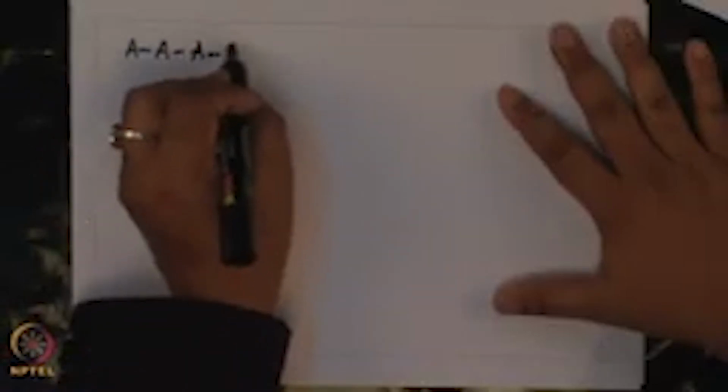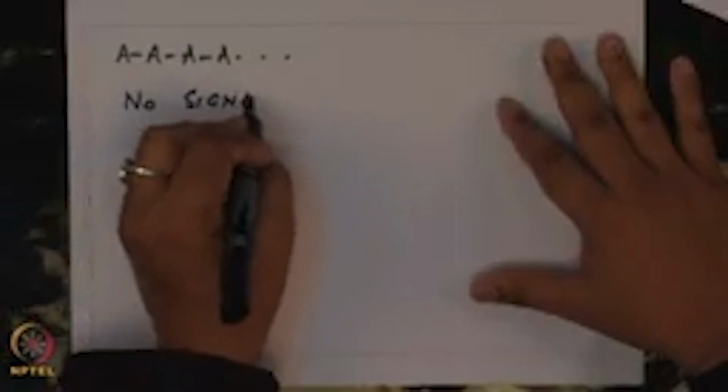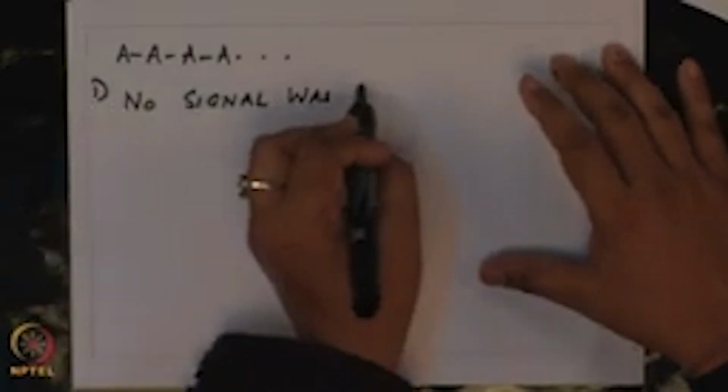After that check, let us say you have made a protein which has this unit A repeating. Typically, if you choose a longer length, there is a greater likelihood that the protein will fold, versus making just 2 A's. But let us say you did the AFM experiment and you saw no signal at all.